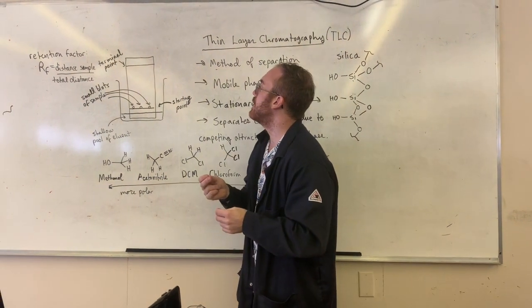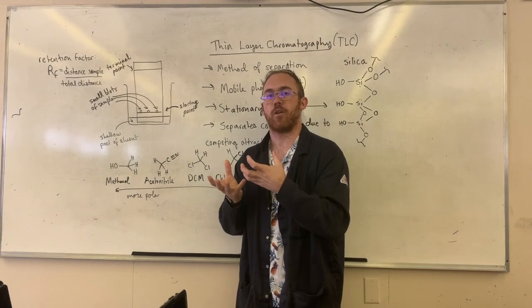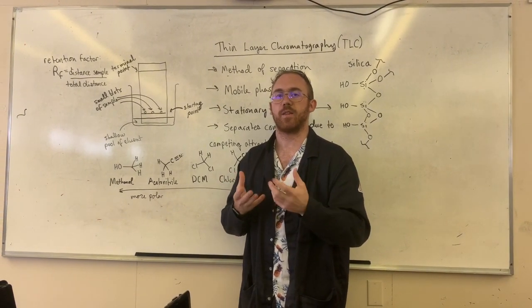You're going to see the eluent pull out those first compounds that are going to be most soluble in that eluent and least interacting with that silica.